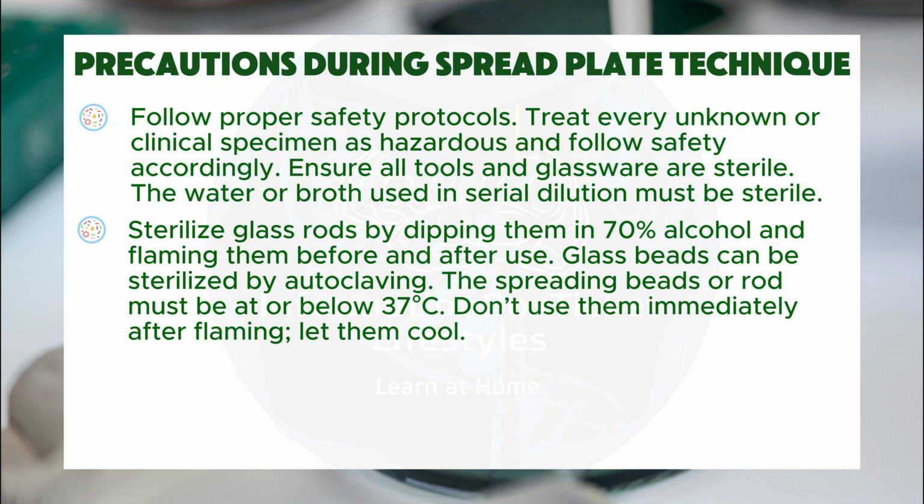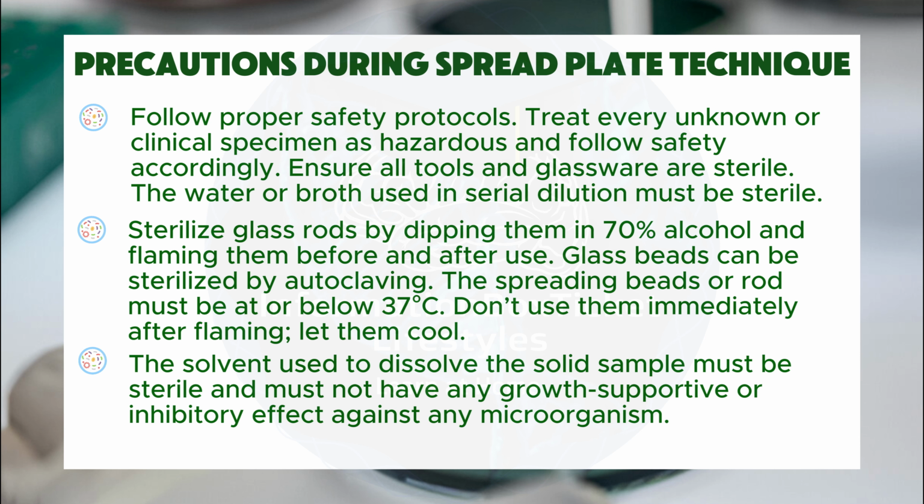Glass beads can be sterilized by autoclaving. The spreading beads or rod must be at or below 37 degrees Celsius. Don't use them immediately after flaming. Let them cool. The solvent used to dissolve the solid sample must be sterile and must not have any growth-supportive or inhibitory effect against any microorganism.